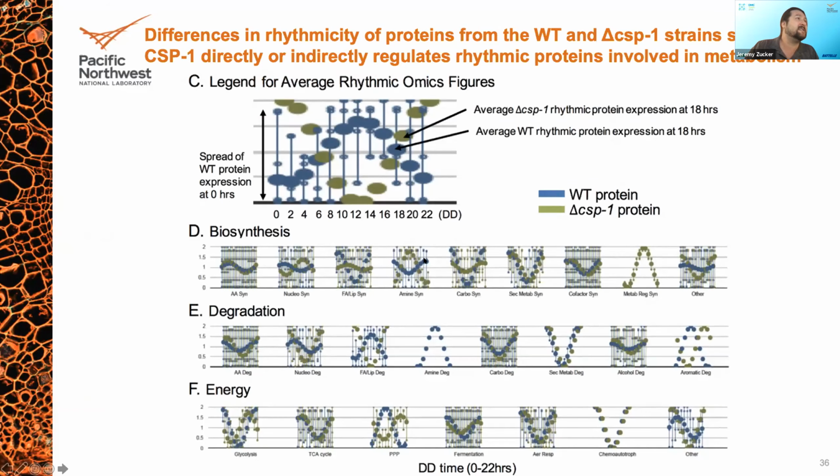But it still continues. So even though it's still circadian, the phase is shifted as a result across many, but not all, of the different metabolic pathways.